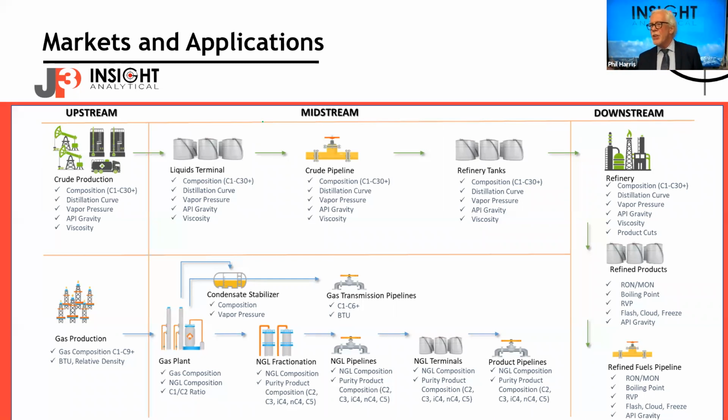When we look at the products, pretty much every place where somebody wants hydrocarbons measured is somewhere we have applications for the technology. A lot of it is in the analysis of natural gas, because Dirk is probably one of the most competent people you're going to talk to about flow measurement and compositional analysis for natural gas. Everybody loves their chromatographs because they're accurate and relatively reliable, but again, there are moving parts, injection valves, and calibration.